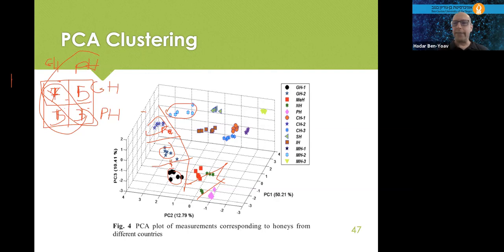So this is the classification model. It was only like 1 or 2 minutes, but this is the way it's done, and there is a similar way for regression models, like if you want to know the concentration, not the origin, how much we have of specific molecules.